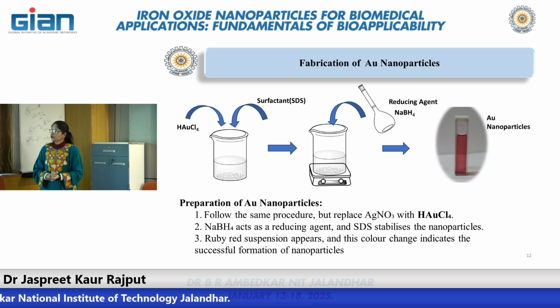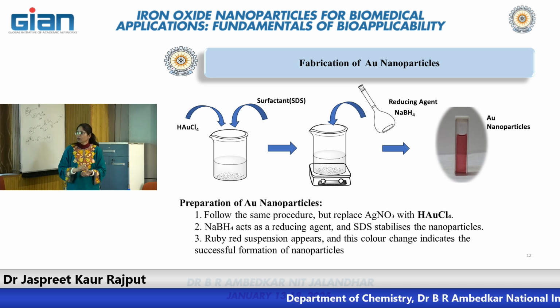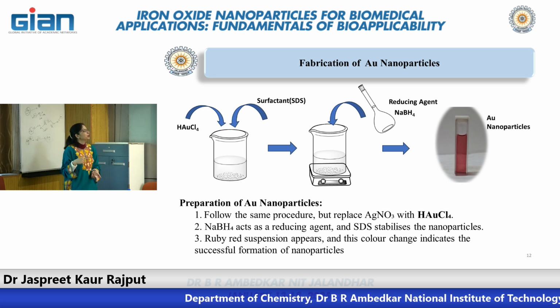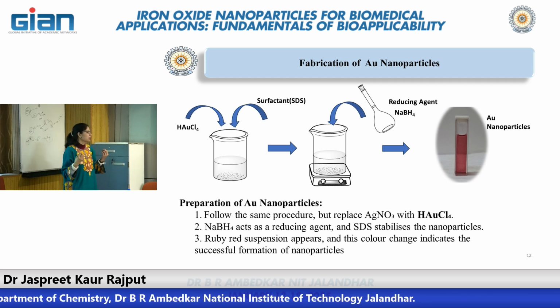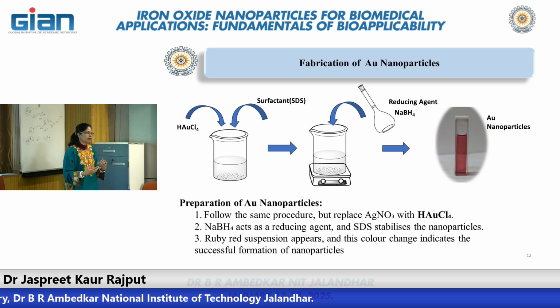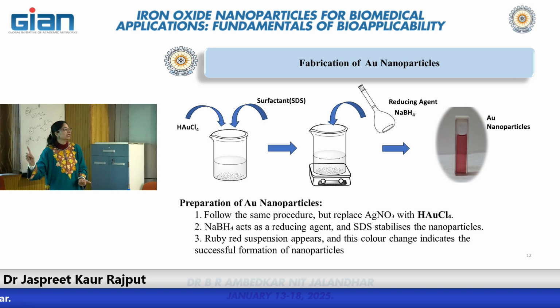So now you can synthesize gold and silver nanoparticles by these two techniques. Two different salts will be used in this case. The procedure is simple, and the different colors let you visually detect the formation easily, right? This is the best characterization technique. You have the sensory system, you can view through the eyes, and apart from this you can check it through UV spectroscopy.